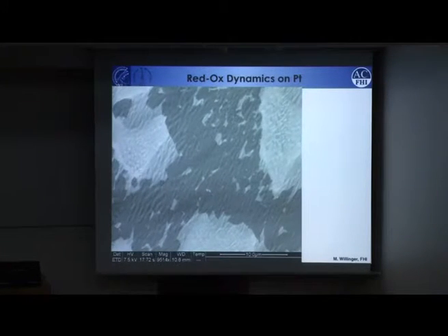So what you have here is 900 degrees. You have a very noble metal like platinum. And I just learned that platinum is noble, wouldn't oxidize, at least at 900 degrees in hydrogen atmosphere, wouldn't form a surface oxygen permeated region. But as soon as we just added a little bit of oxygen into the growth feed, we saw these dynamics on some grains.